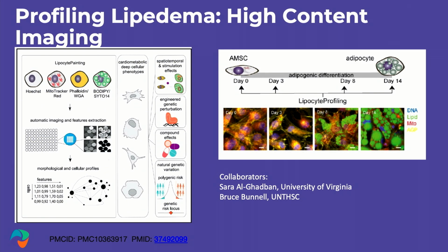So here is a quick preview of what that looks like. This technology for adipocytes and for lipid cells was developed at the Broad Institute in Boston, which is affiliated with Harvard and MIT. So we took advantage of some technologies they developed to apply it to lipedema. This is one of the missions of the foundation, to take the latest technologies and adapt them to lipedema. Lipedema is a nascent field. It is new. So we borrow from everywhere that we can and bring new technology to study this disease.